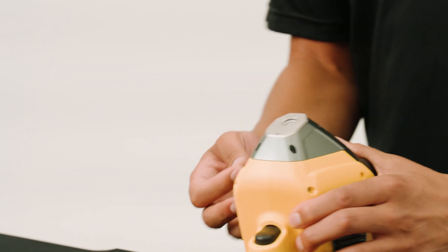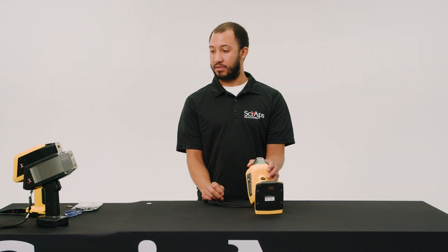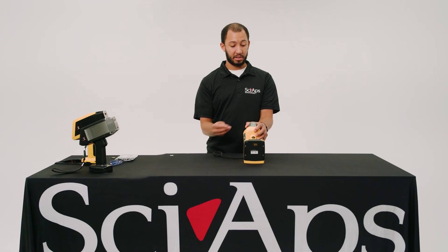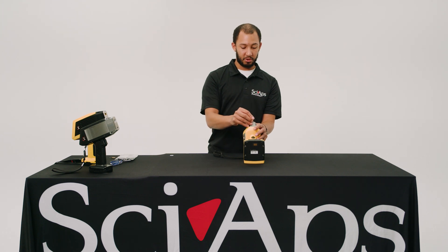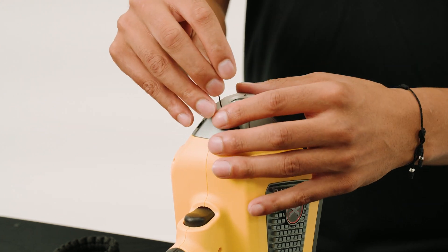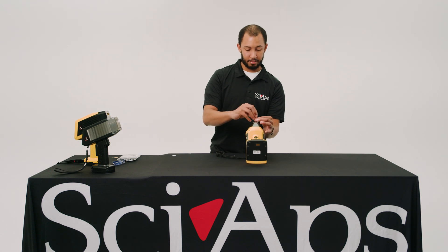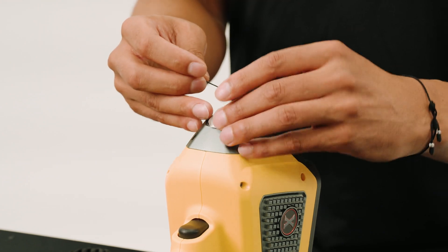Next, we'll be moving into our X550 unit. This one's a little different — the nose plate isn't the same as our X505 units or any of our other units. This one requires an Allen wrench, which comes in the kit that we provide for you. On the other units, when you remove the nose plate, the screws will stay in with the nose plate — there are four screws and they will stay in for the most part. On this one, as you can see already, these screws can tend to get lost pretty fast and they're very small. So just be very careful and gentle with these, please.